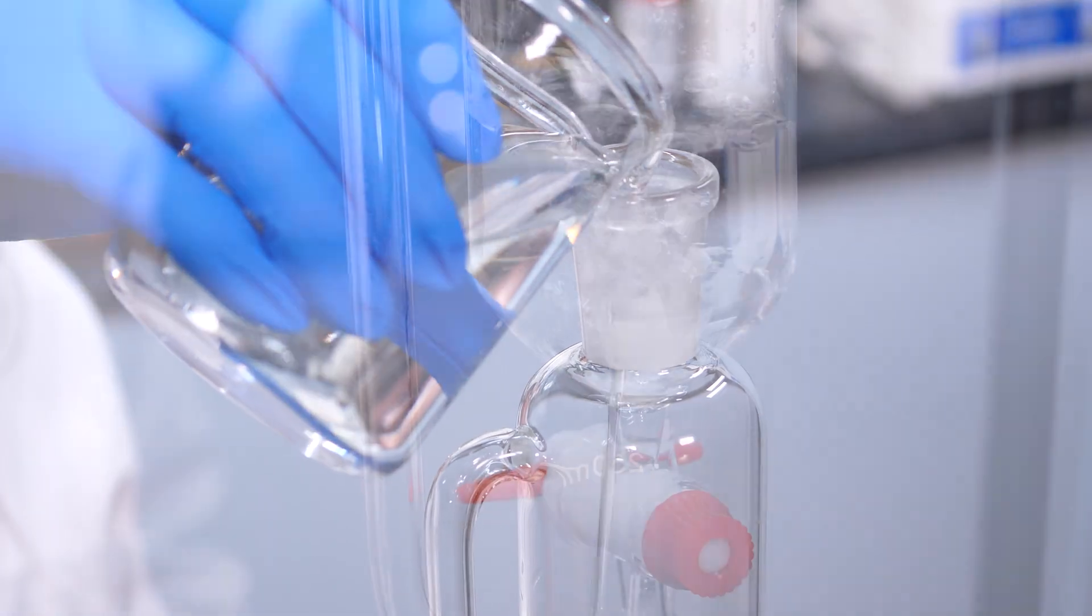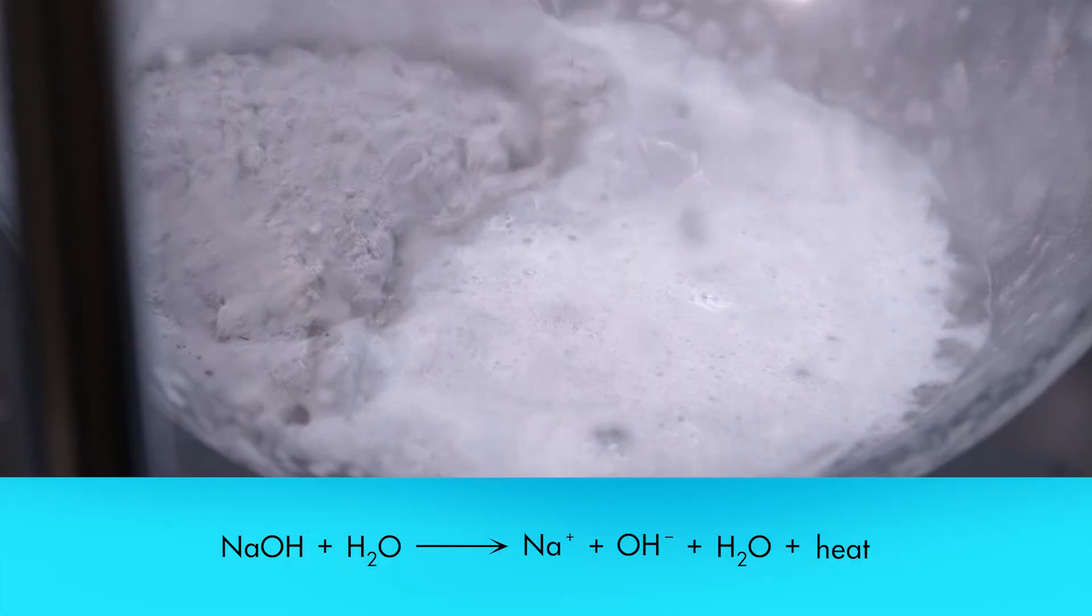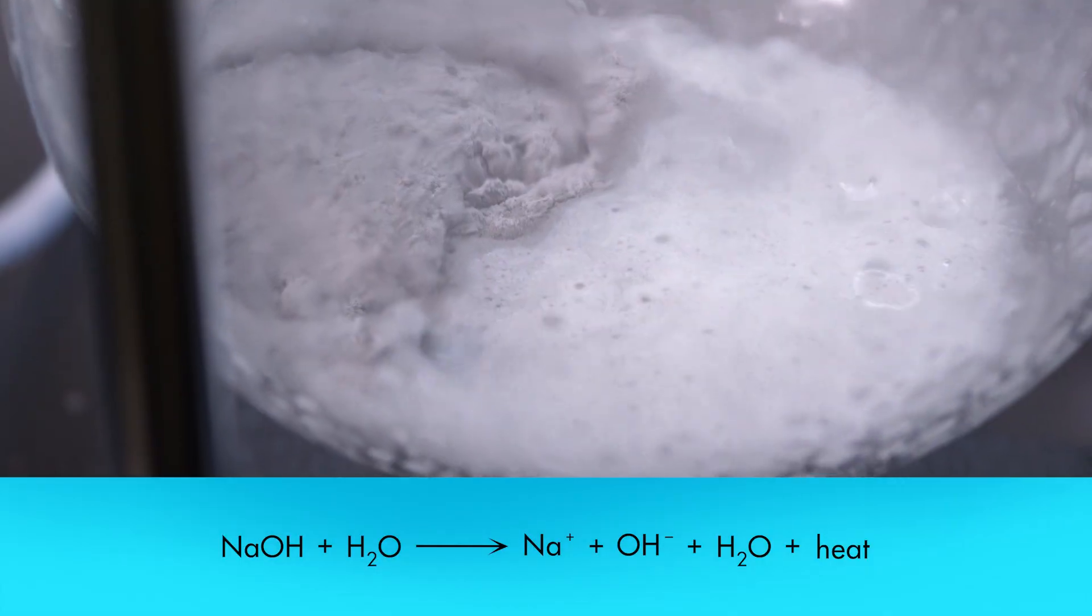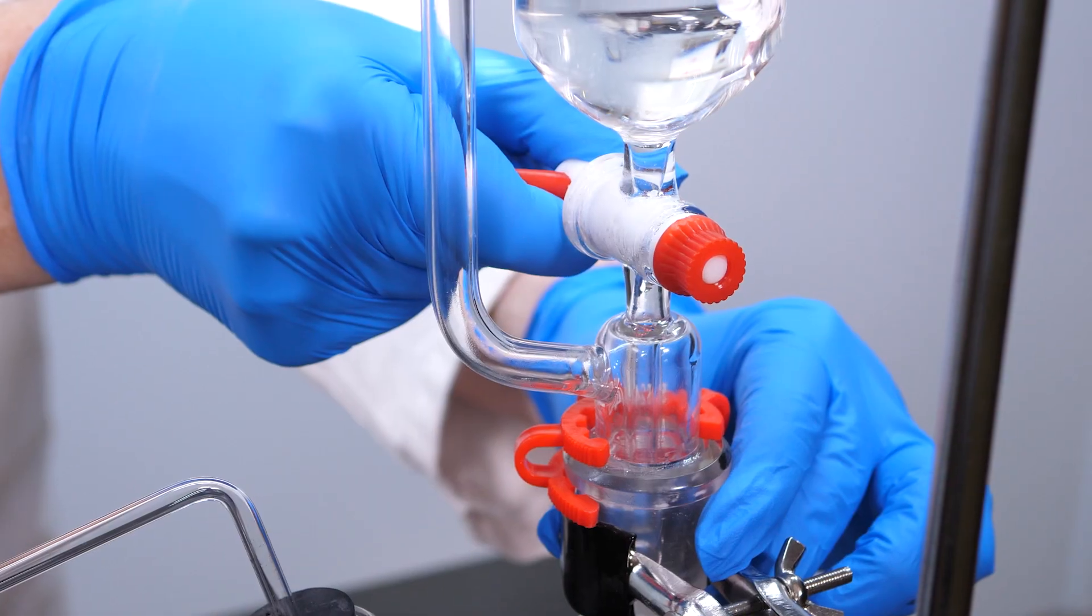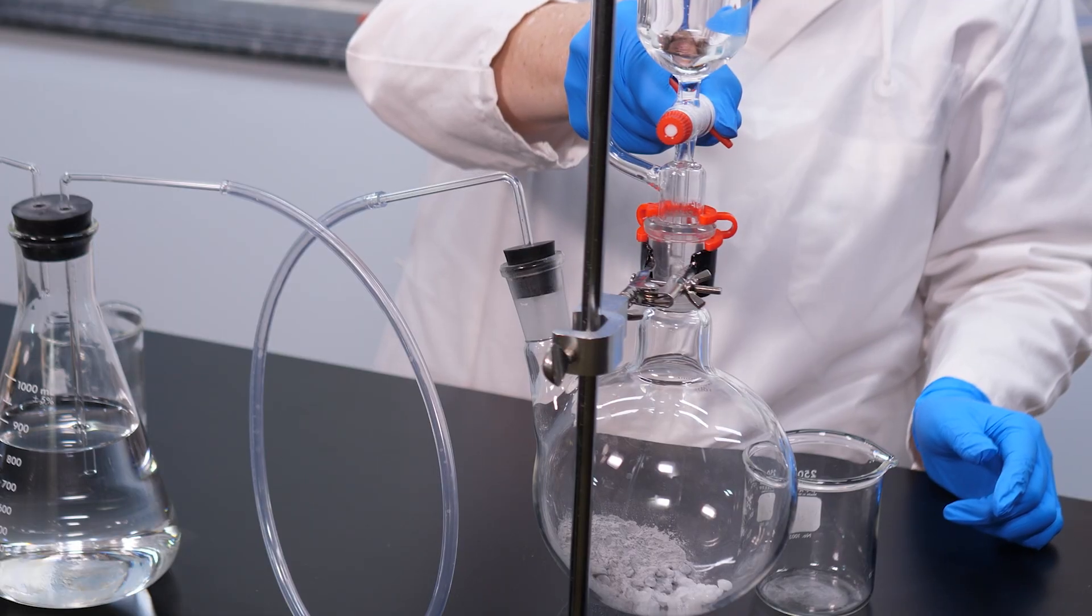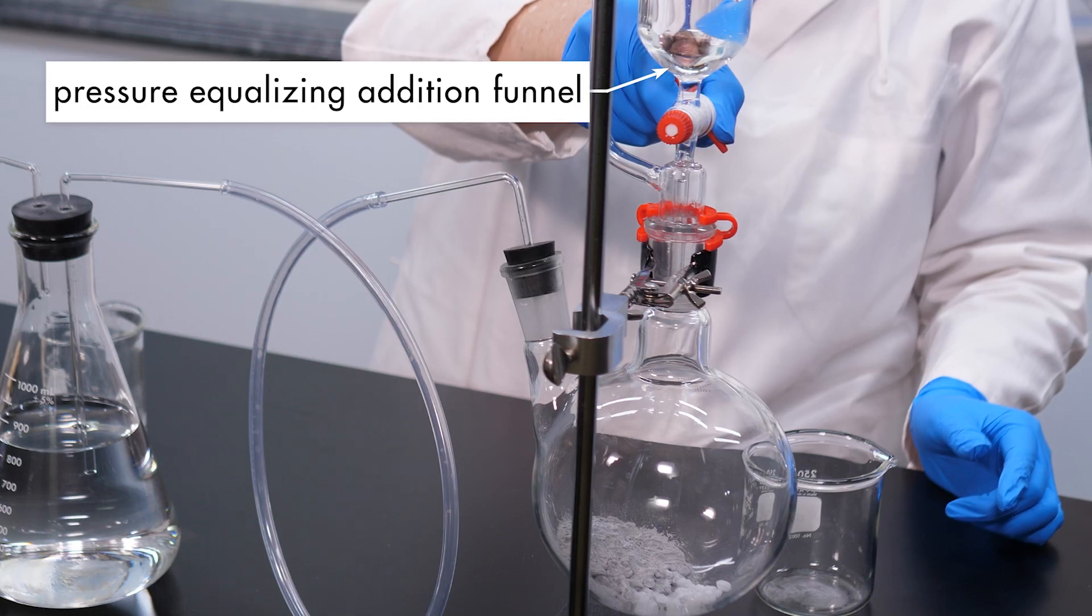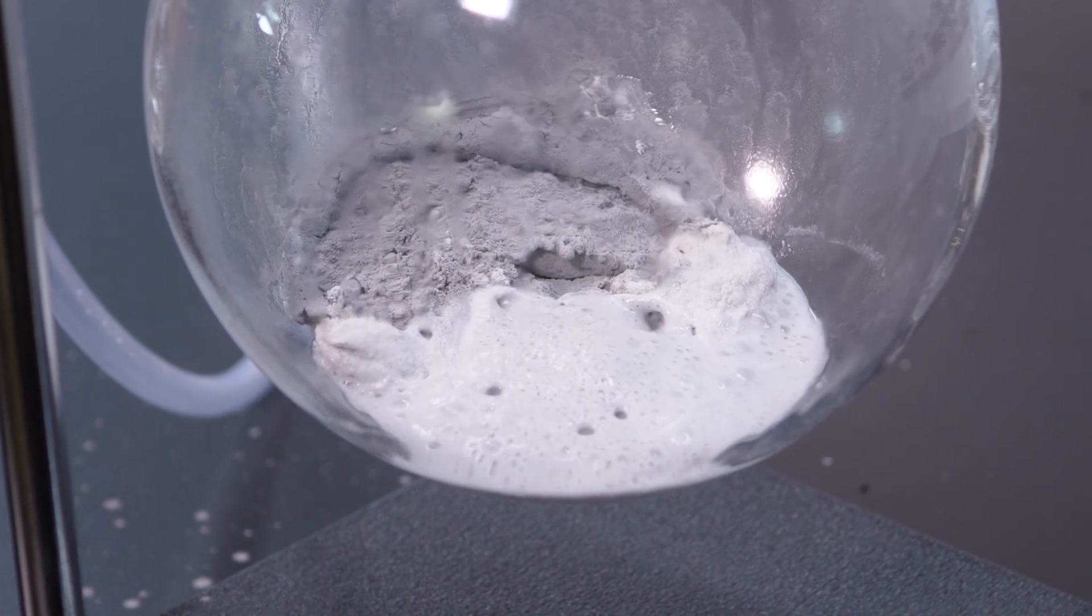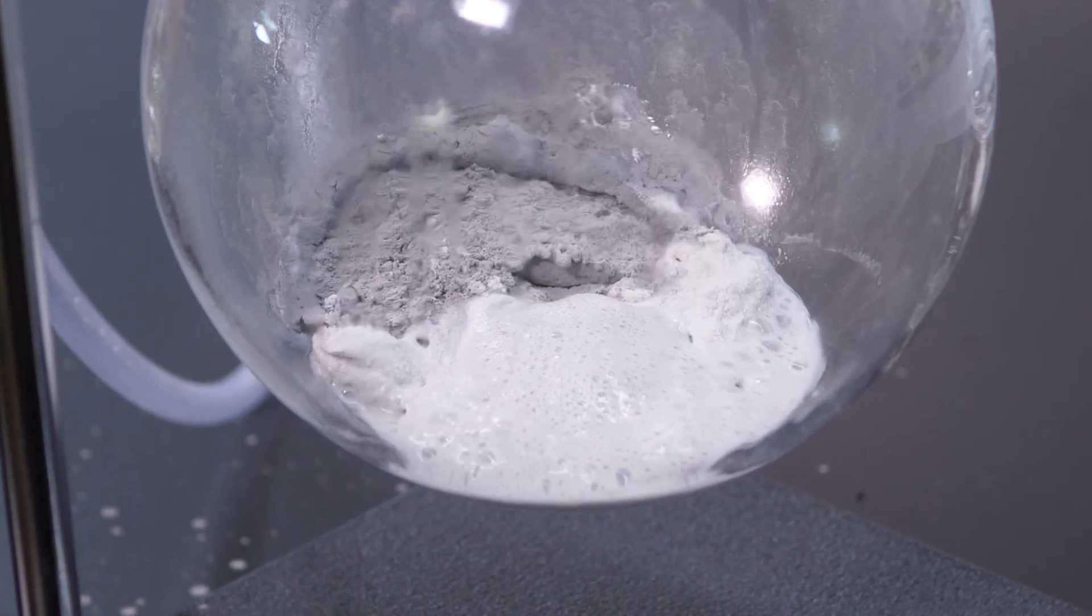To speed up the reaction, we pour 150 milliliters of water into the funnel. When sodium hydroxide dissolves in water, it completely ionizes, which produces a great amount of heat. The heat generated by the reaction may cause the solution to boil. To prevent the boiling solution from being forced up into the funnel, we use an apparatus called a pressure-equalizing addition funnel. As the reaction heats up, the sodium hydroxide reacts more quickly with the aluminium to produce sodium aluminium hydroxide and hydrogen gas.